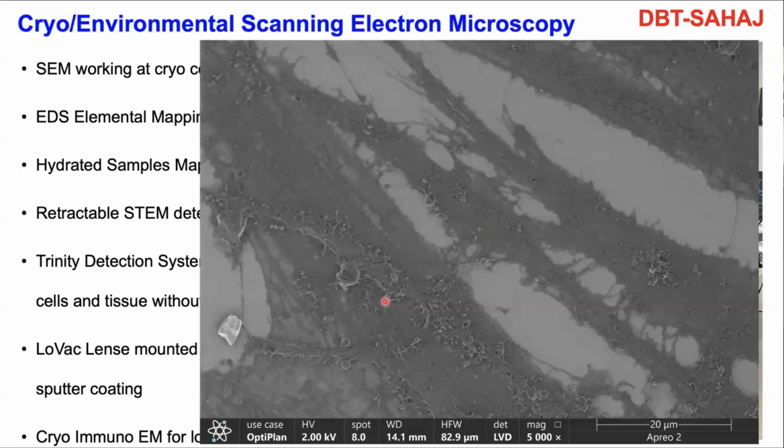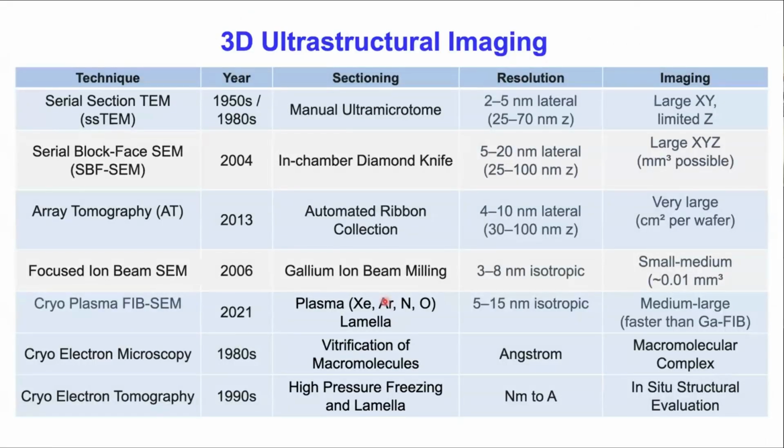So this is why I'm saying that these are the equipment which can add to the advancement of FIB. FIB is not going to evolve immediately; it is going to evolve with multiple channels required. And currently, people have a very good idea that they can generate 3D ultrastructures.